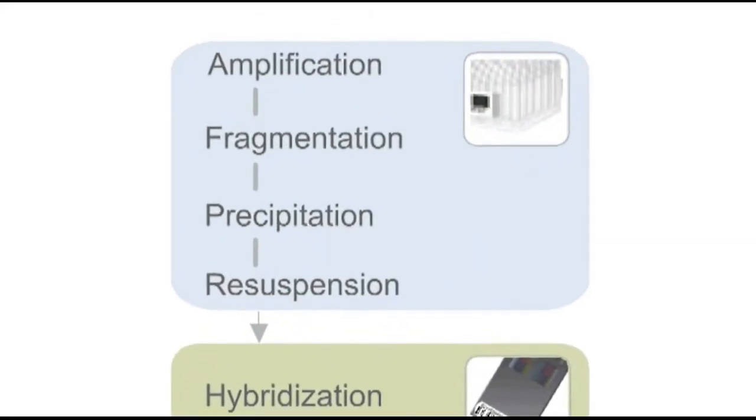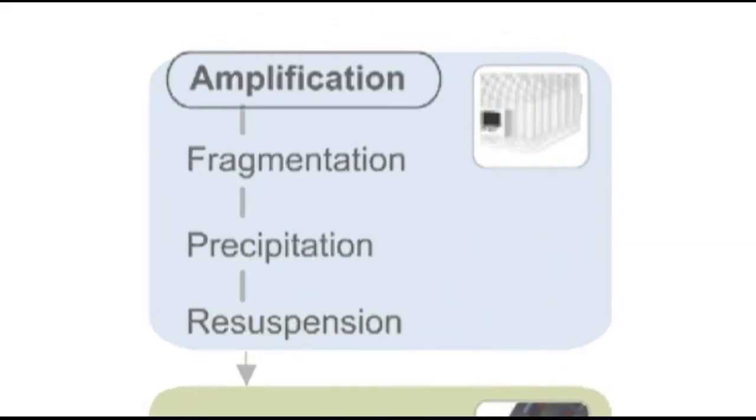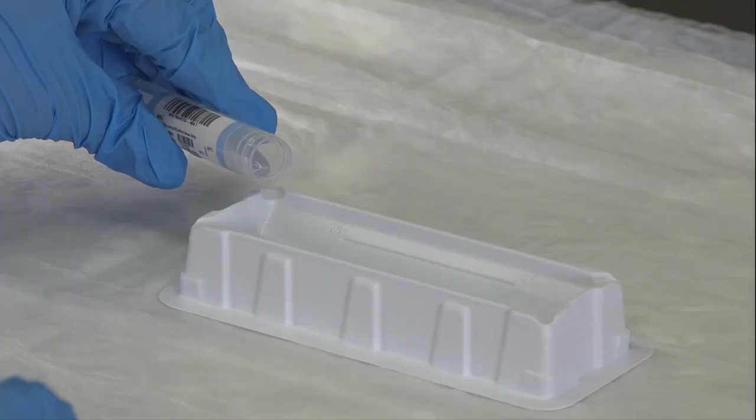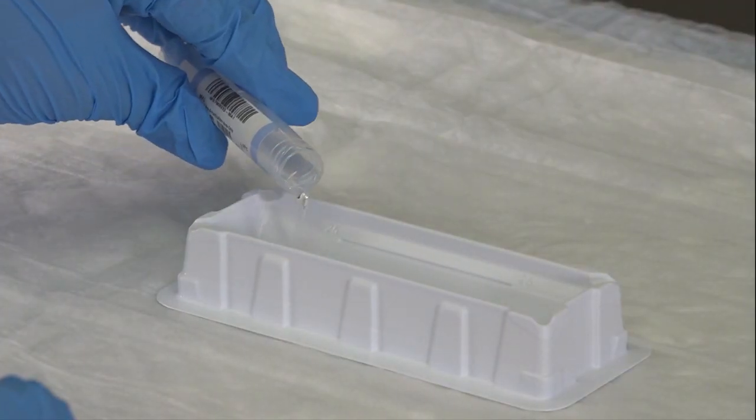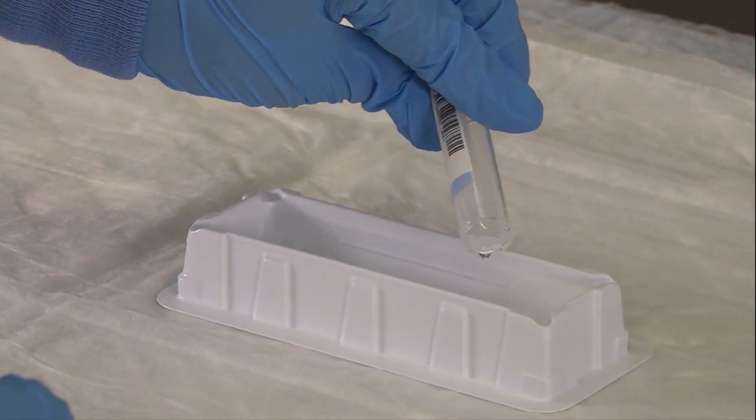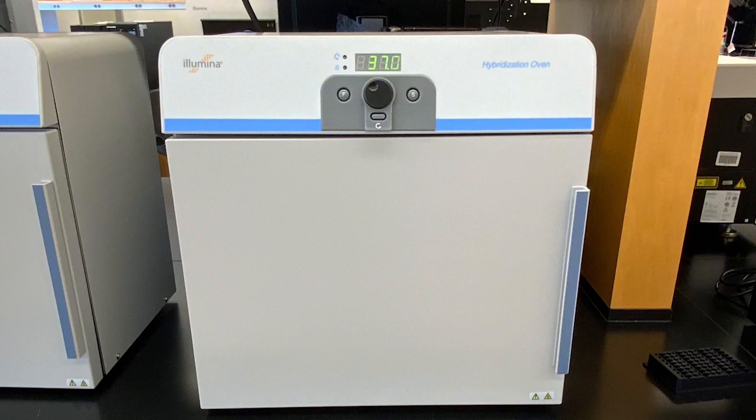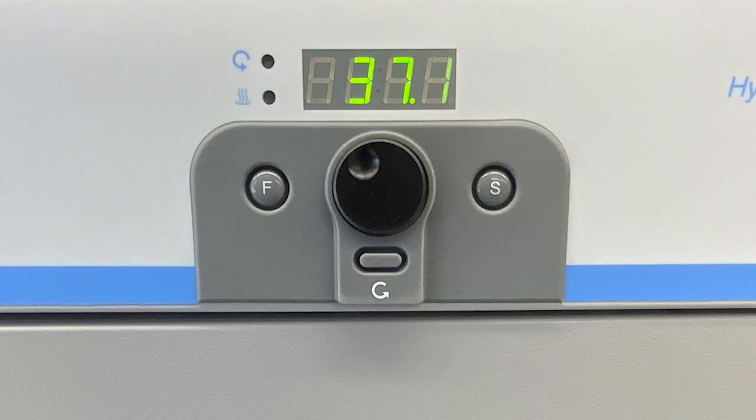The first step of the Infinium assay is amplification. Remove the amplification reagent from the freezer, allow to thaw, and pour into a disposable trough. Set the hybridization oven to 37 degrees Celsius.